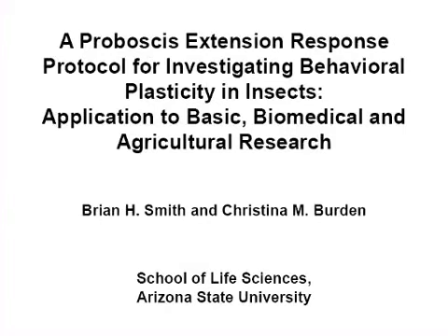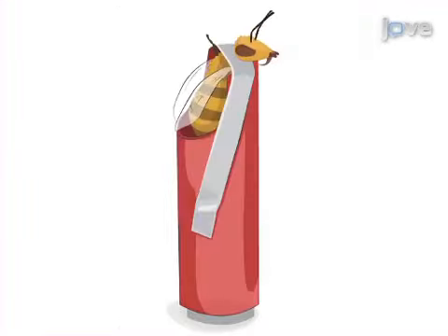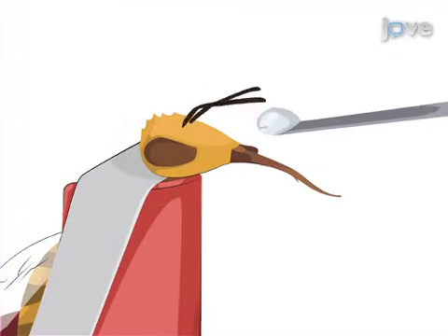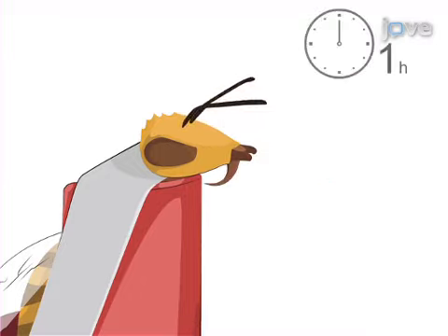The overall goal of this procedure is to show how to implement behavioral conditioning of a simple reflexive response to food in honeybees. This is accomplished by first capturing honeybees, restraining them in harnesses, feeding them a small amount of sucrose solution, and then allowing them to become accustomed to the restraint.